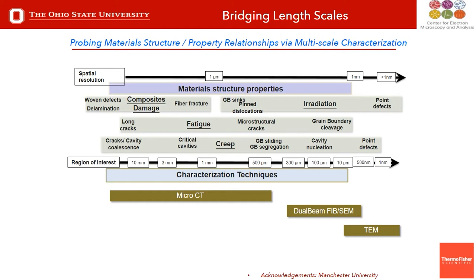If we have things under 10 microns, we'll typically use the TEM. We can use an SEM as well, which has a pretty large range, and we can also use a FIB. A FIB and an SEM will typically be used together in a destructive fashion.